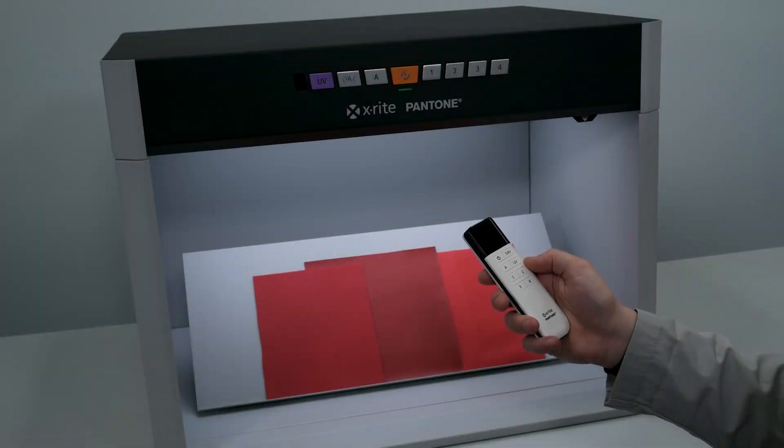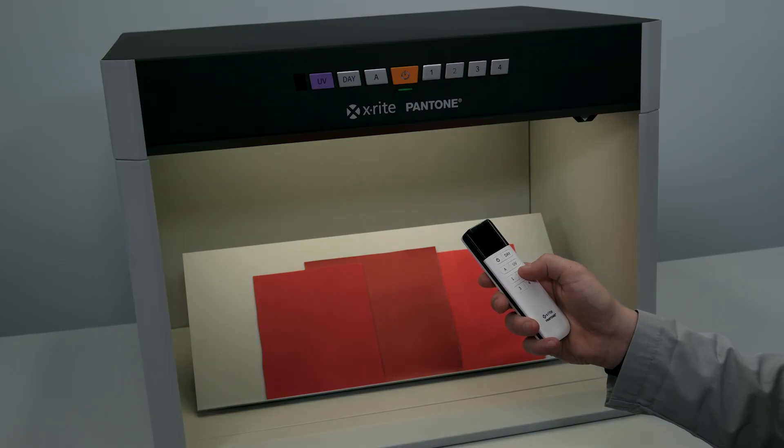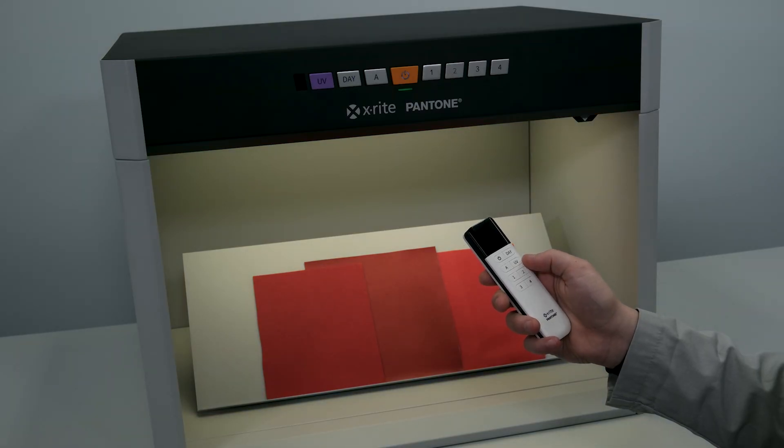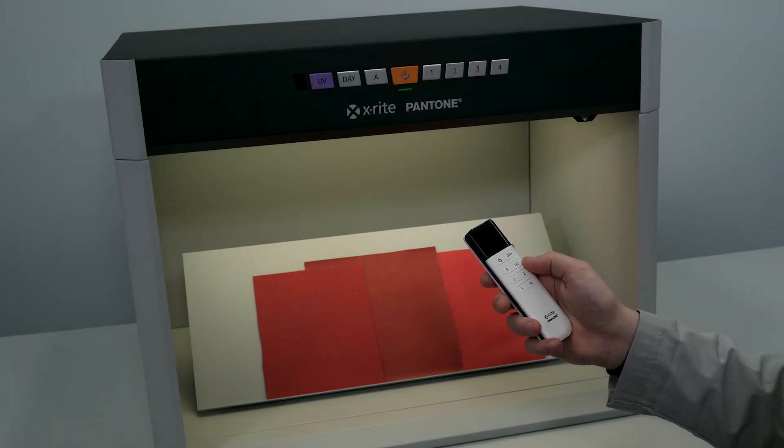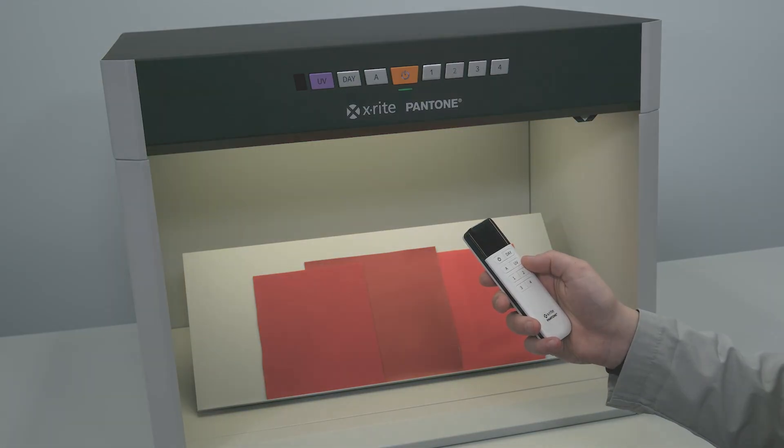A remote control is an optional accessory offered with the Judge LED. All the same functionalities can be performed from the remote.